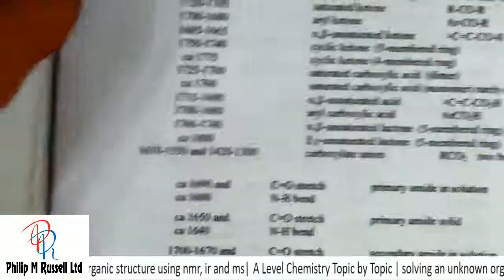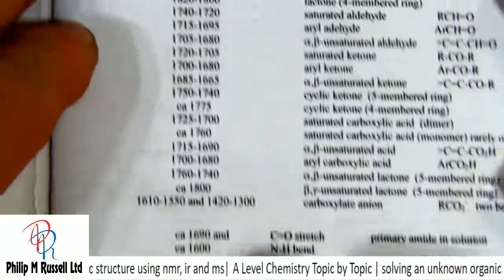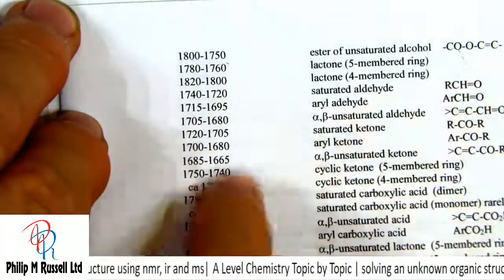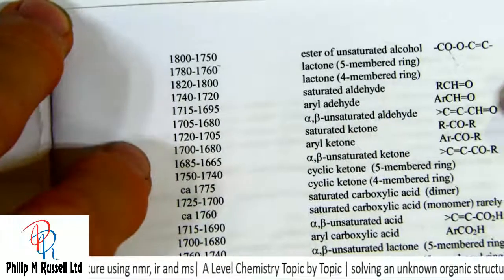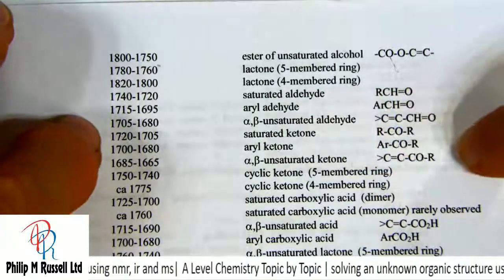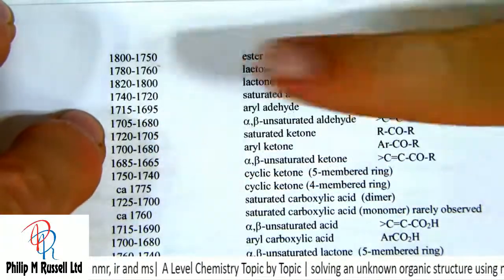It's going to be round. We'd also have it round about where the amides are, aren't we? We're going to have it all there. But what you actually look up is here. It's this one. There we are. It's that one there: unsaturated aldehyde and ketone. You're looking at it somewhere in these values, but we haven't got one.